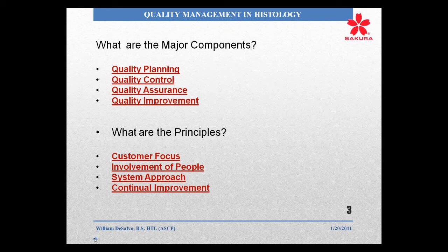Technique: we're very good and technical about having a problem approach in histology. A technique approach would be, you've got a bubble under your cover glass. Being technical people, we fix that. System approach is what caused it, why did it happen? Was it the wrong consistency of the mounting media, were there the right chemicals, did the right person do the right thing at the right time to not create those bubbles under there, and how do you back up either a step 1 or 2 to make sure that that doesn't happen.